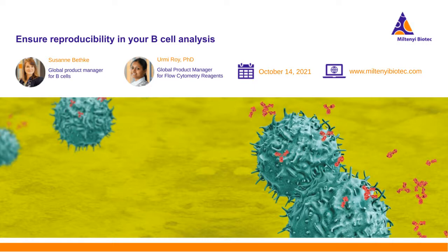Okay. Our next question: why exactly do the REAffinity antibodies have a reduced need for isotype controls? I can take that question, I think. As I also mentioned, these antibodies are recombinantly generated. So we have for all our antibodies a universal backbone, which is from human IgG1.